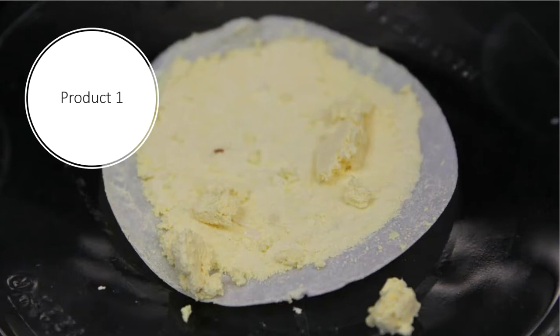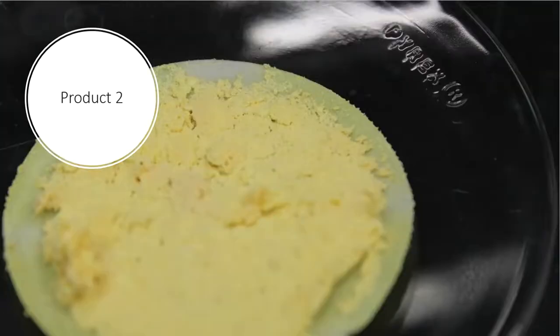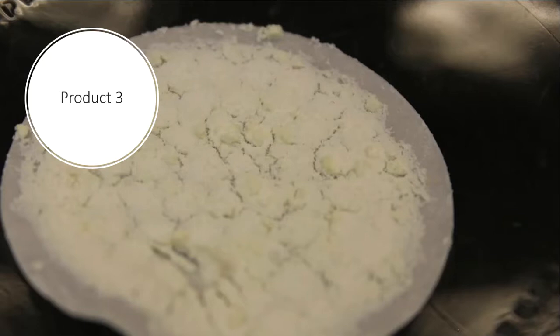Again, make your observations the way that you need to. Here's product number 2. You know, in my opinion, this had more of a yellow color than the first one, and this almost looked like mushed up egg yolk to me. I mean, that's kind of what it looked like, in like a deviled egg. That's kind of what it was. And then here is product number 3 as a close-up. Notice that this is not fully cream or white from top to bottom. There are little specks of yellow that might be present in those crystals, as you can see. All right, so there's product number 1, number 2, and number 3.